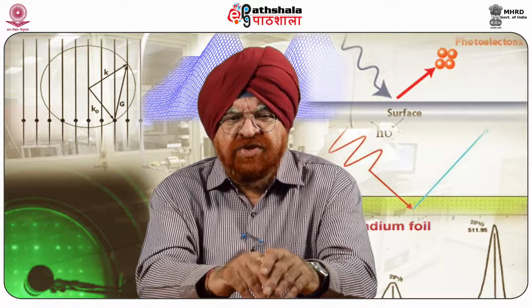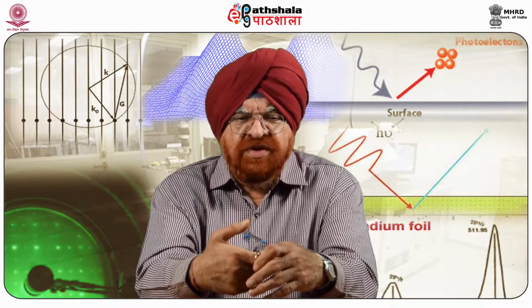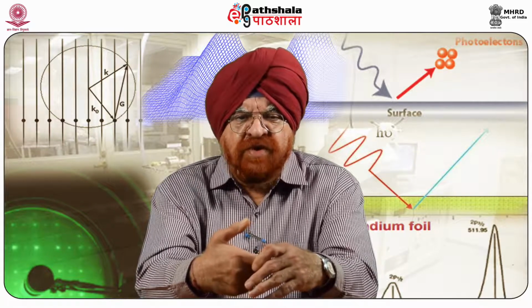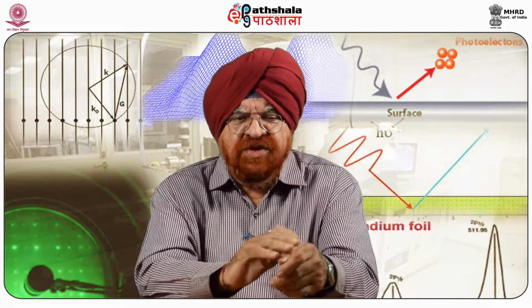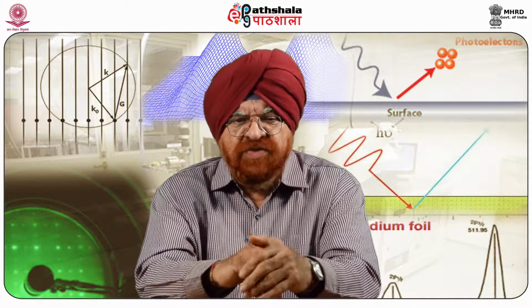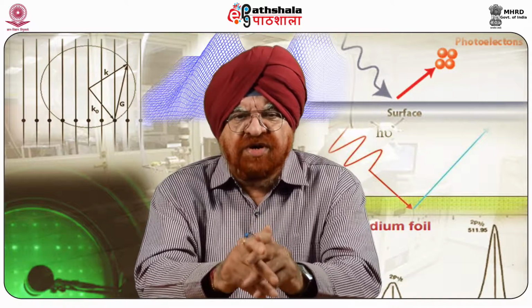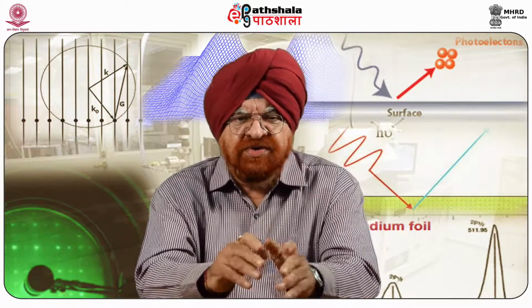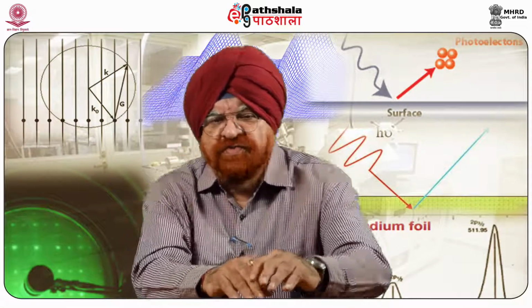By adopting this procedure at the bare substrate-film edge, the MFM tip will experience a signal difference which is proportional to the magnetic response of the probed region. Now, considering that the crystalline quartz gives no magnetic contrast in the MFM measurements, the observed MFM signal is exclusively due to the germanium manganese film.